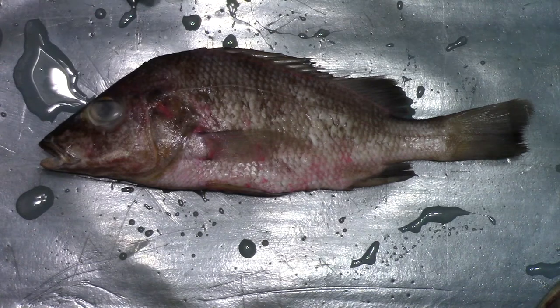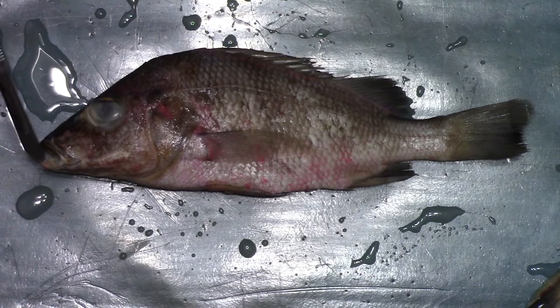Here is a preserved yellow perch. First up, looking at the external anatomy. We have the mouth — it's a terminal mouth, it's right on the end.